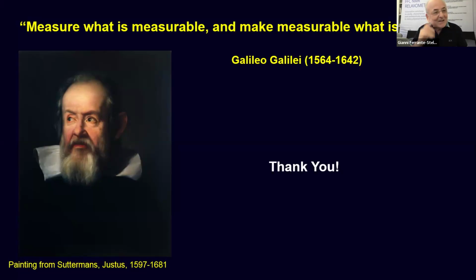I'm not sure I could explain exactly which is the issue. We want to make this data interpretation available to normal users. I understand completely, but of course it's not necessary to do what you suggested, to prepare a set of parameters depending on the system you want to observe. You need to prepare some basic parameter setup to make sure that you collect the signals at the best. This is something we have been discussing in the last 5 years.